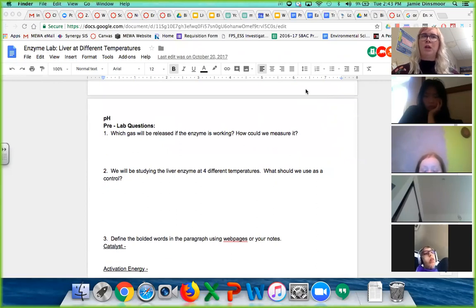Are you just going to believe me? You should all be going, yes, we believe you. But how are we going to prove that? We could measure the oxygen levels in the liver and afterwards. Okay, so maybe that more oxygen would be present in the liver after it's broken down. Maybe. See the difference? How am I going to test that? By just looking at it? Can I see it? Do I need a $5 million tool to do that?